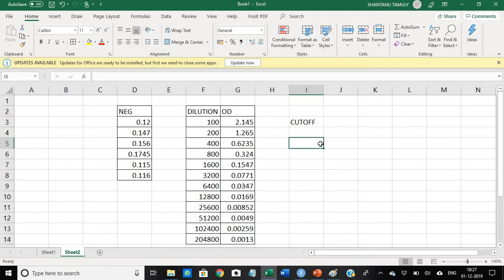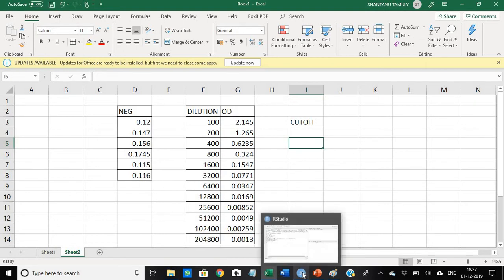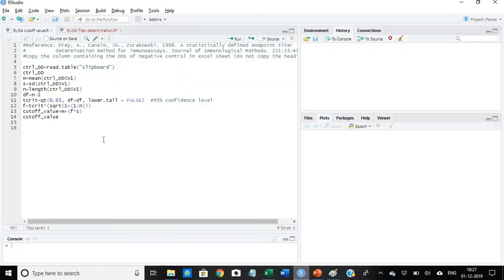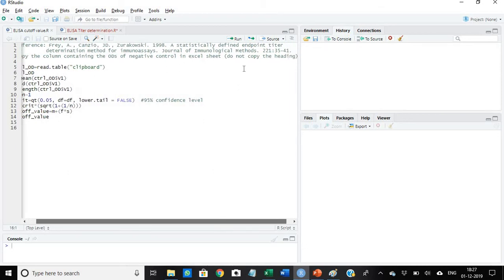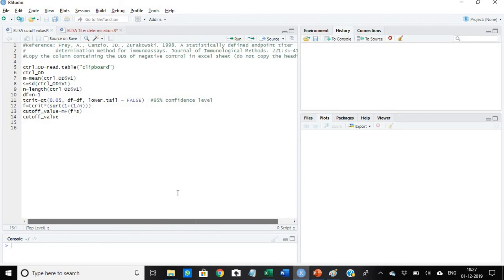So I have already installed the R software and now I installed R Studio also, so I will demonstrate how to do it in the R Studio. So let us open R Studio. This is R Studio. Here the cutoff value will be determined using the method described by Frey et al 1998, a paper in the Journal of Immunological Methods.